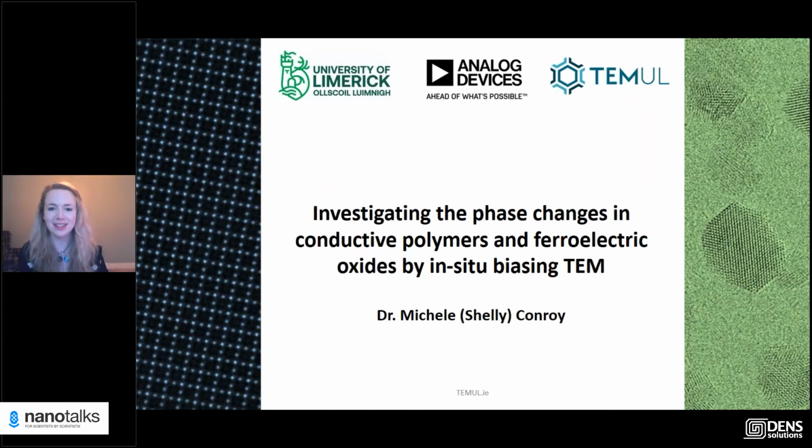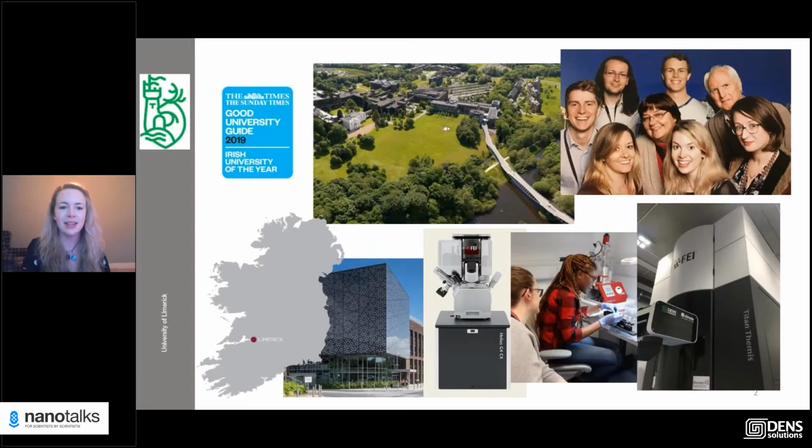Thanks a lot for the kind introduction. So today's talk is going to be divided into two. The first part is going to be conductive polymers, and the second part is the major project with my group that's led by Professor Lisa Bangert, so ferroelectric domain walls. And I hope I get across to you how important it was for us to be able to do in situ biasing, and specifically that the stage was stable. Otherwise, we couldn't capture some of this really interesting physics.